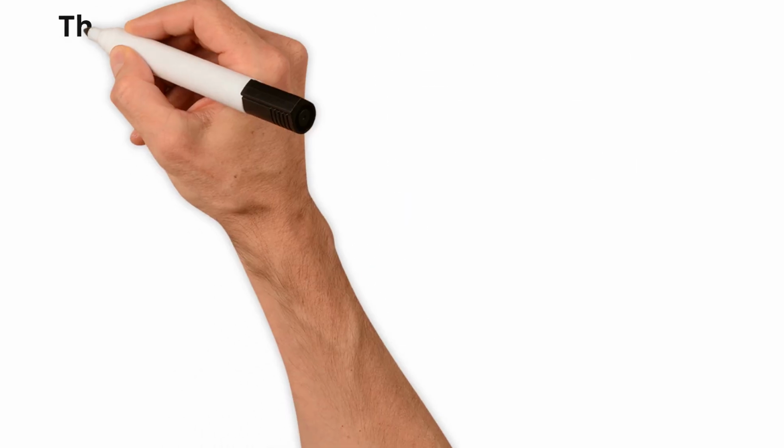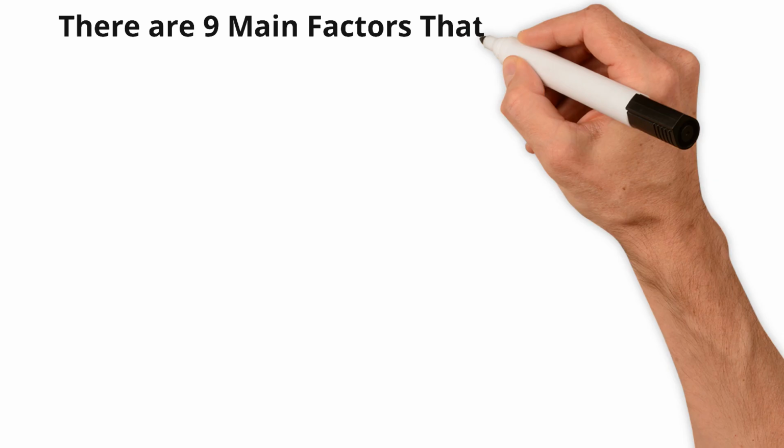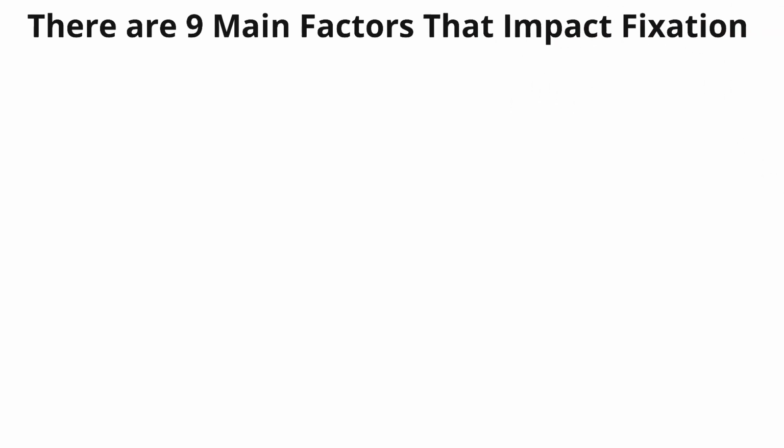According to Freida Carson textbook, there are 9 main factors that impact the fixation process.